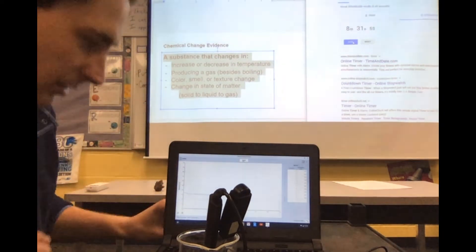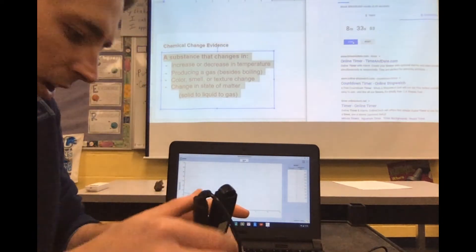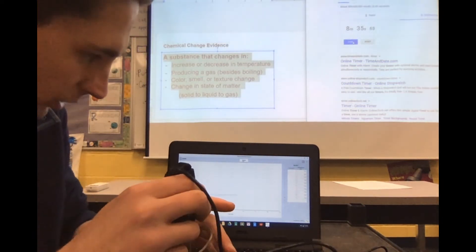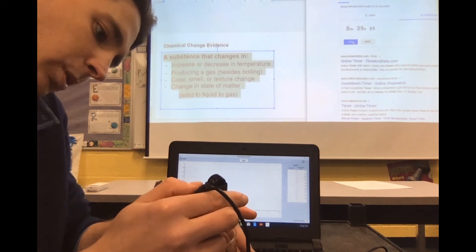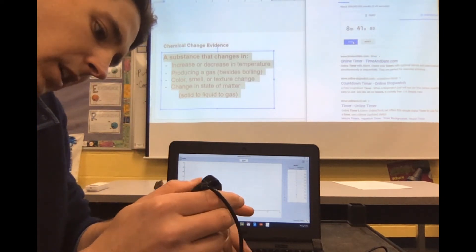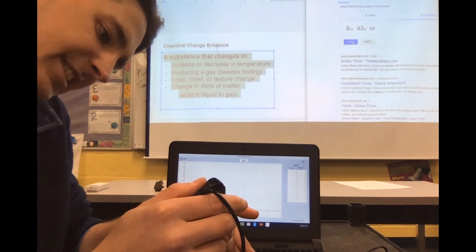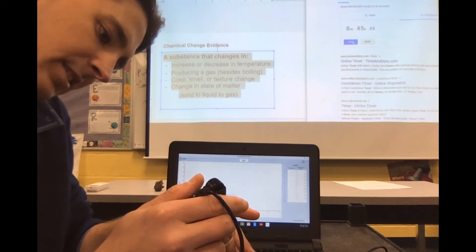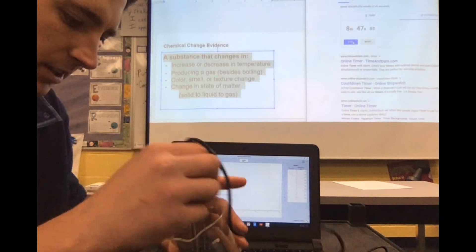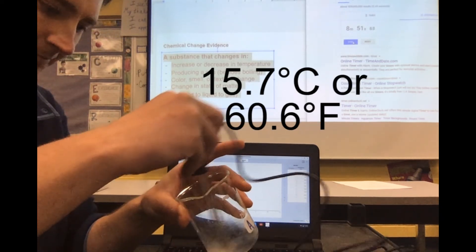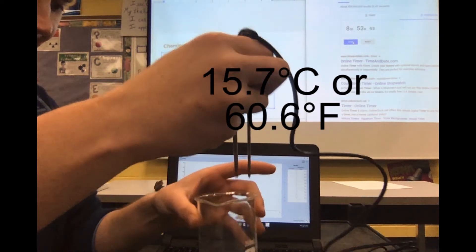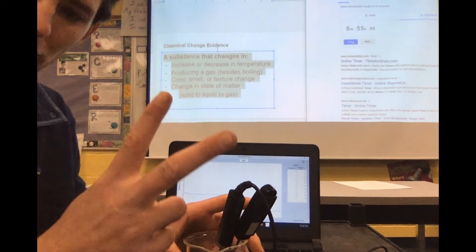Repeat two more minutes. It looks like it has plateaued, 15.7, 60 point six. Be back in two minutes.